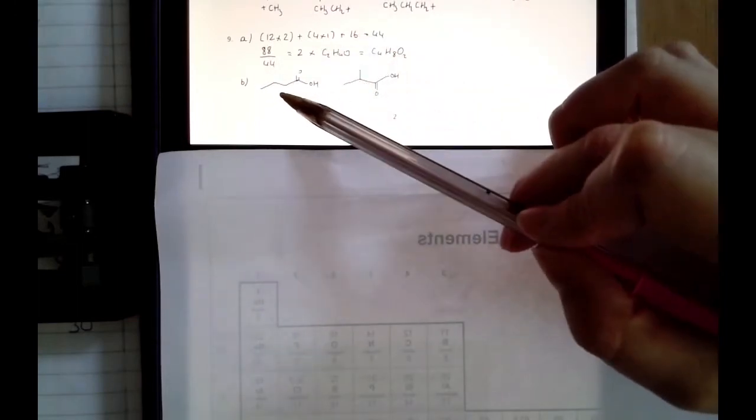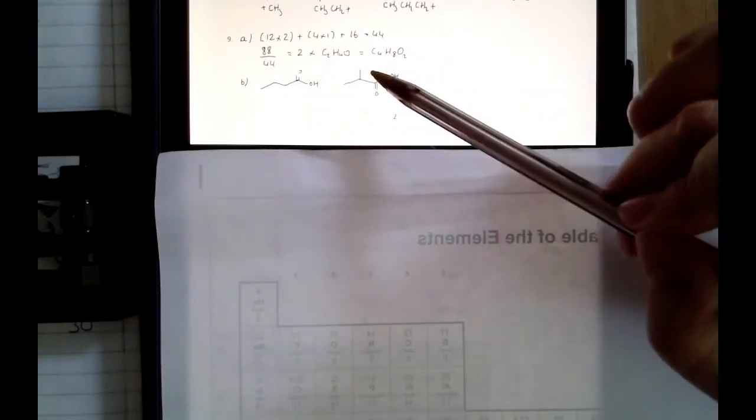CH3, they will both give me a CH3. Okay, I can break this bond here to get a CH3. I could break this one or this one to get a CH3. The next one, mass of 59. So again, that's not really a fragment that you'd be familiar with.